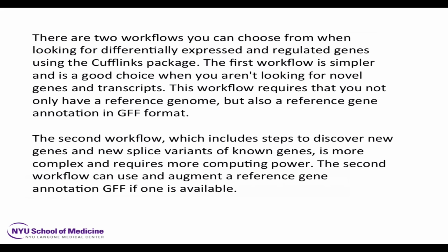So now those genes which overlap a known gene get a name, and those genes which don't get a name, plus you get a ton of novel isoforms that weren't considered in the reference annotation, because RefSeq only annotates a small number of isoforms for each gene, whereas in reality there's a huge mass of isoforms, some which differ only by a couple of bases.